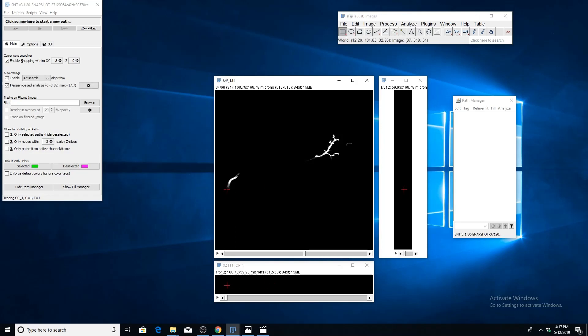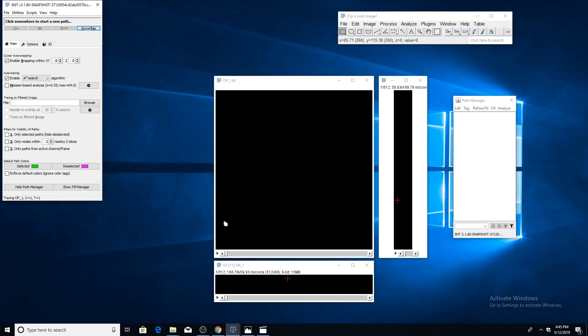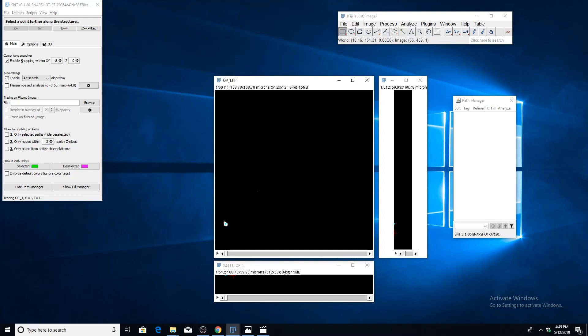Now we're ready to begin tracing. If you look at the top of the dialog here, it's asking us to click somewhere to start a new path. Let's find where we want to place our first point and then just click there in the image.